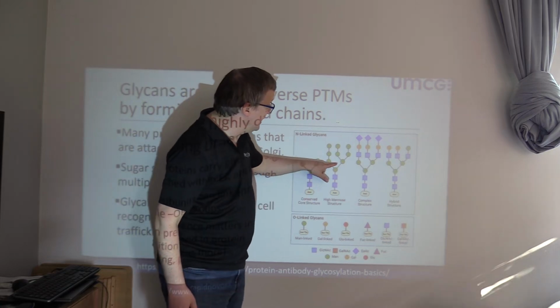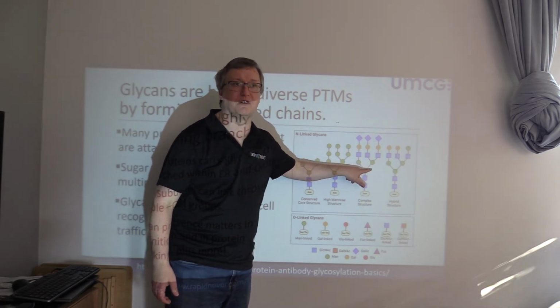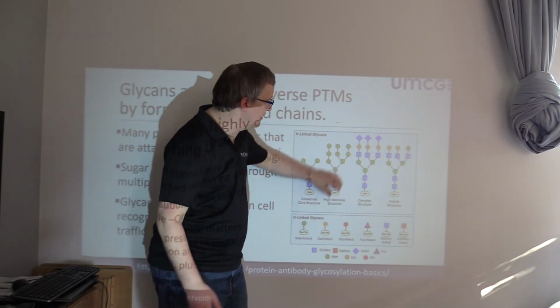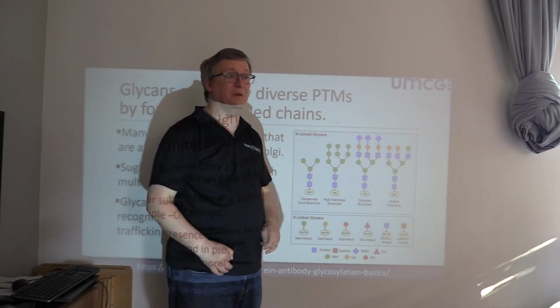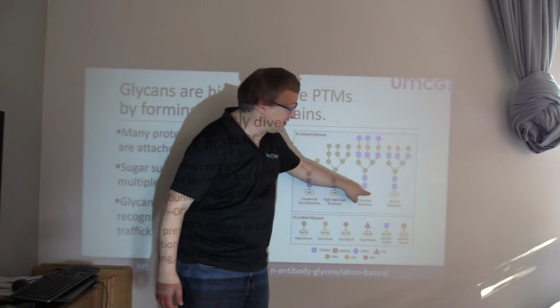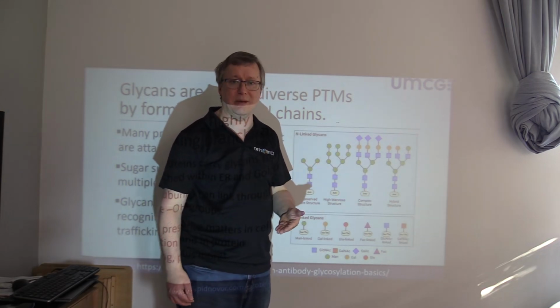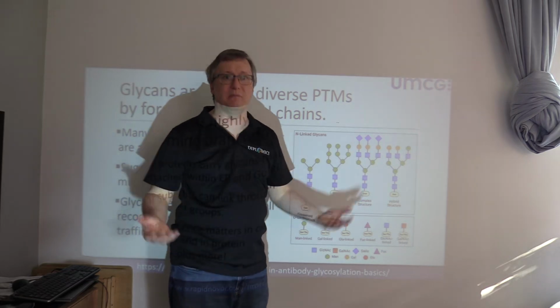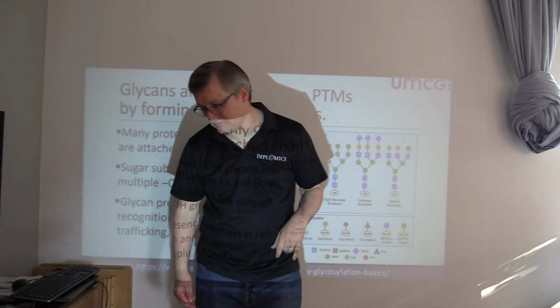So we can find ourselves encountering branched saccharide chains, and this can give you a very complex structure that you need to look at. So if you were to treat all of this as just one ginormous mass stuck to a particular site in the peptide, much of the mass of the peptide is made up by sugars, not amino acids.